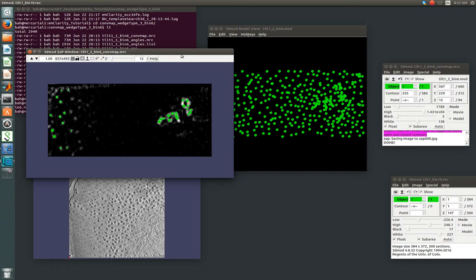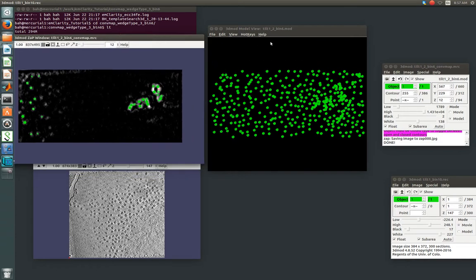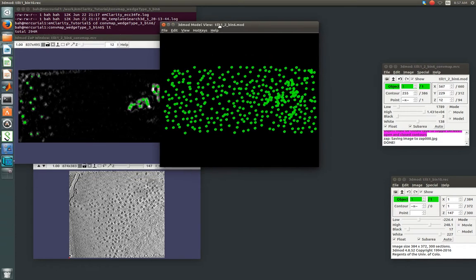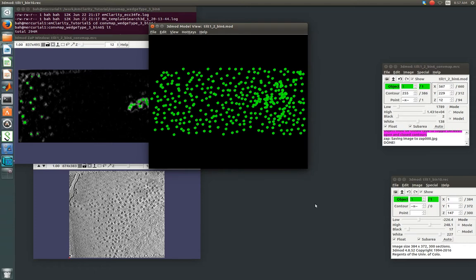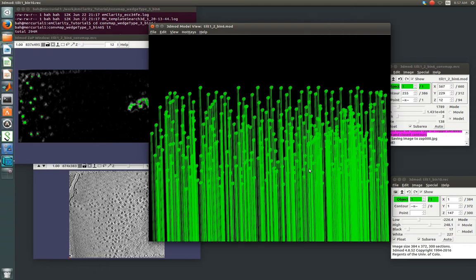But there's a much faster way to go through and edit that, and that's in this 3D window, which I'm going to expand a bit. So, to rotate this, so this is something that happens quite a bit. For some reason, it may not happen on your system.